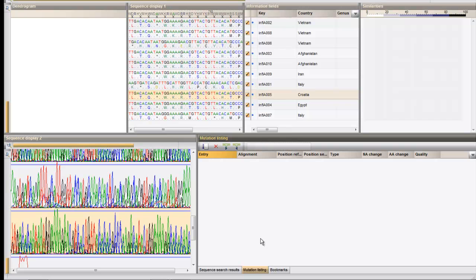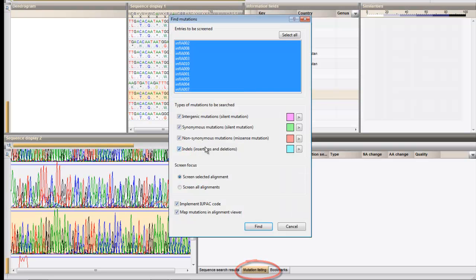The mutation search tool is designed to detect mutations in individual sequences based on comparisons with a consensus. Press this button in the mutation listing panel.